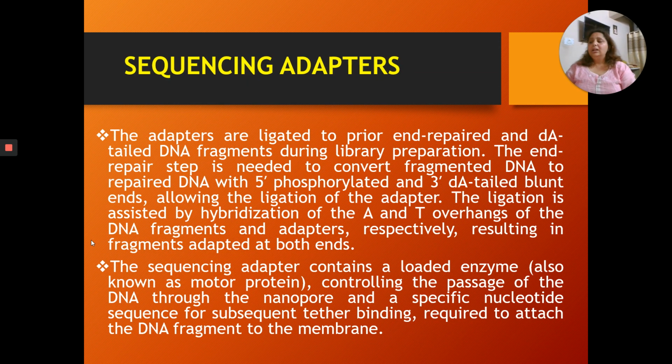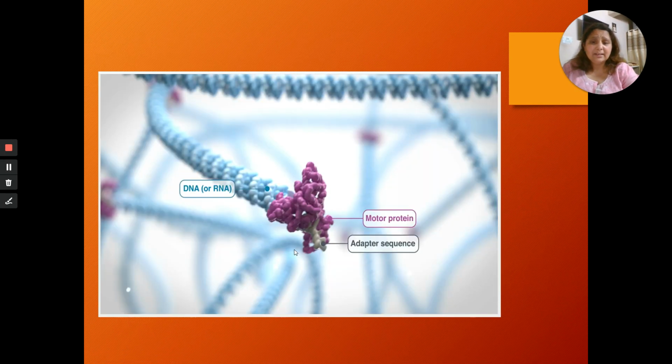Now coming to what is the significance of these sequencing adapters? In these sequencing adapters, what is the function of this protein, the motor protein, that is attached, and what is the function of this tether? Okay? So let us understand that.